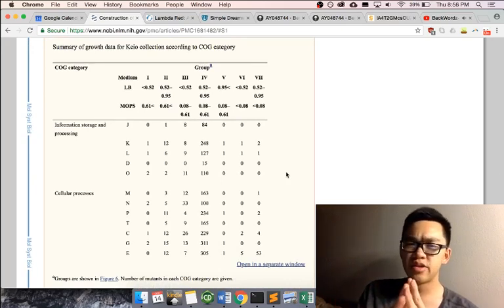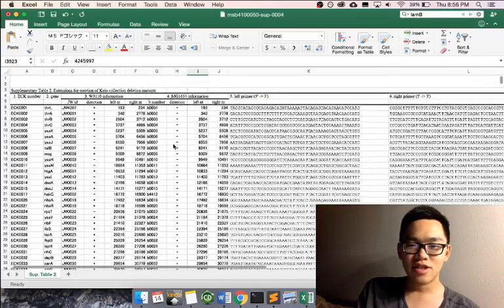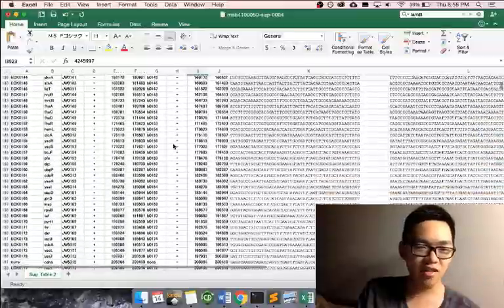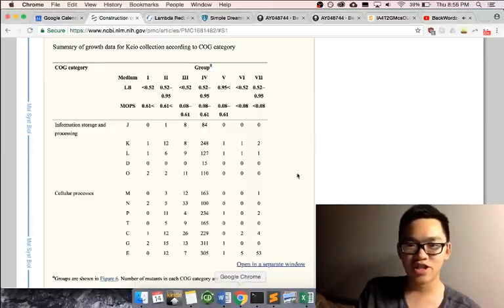I hope that kind of helps you. Just remember, PKD13 is the kanamycin cassette, in case you ever forget. That's where I had problems with. And in case you're ever looking for the primers that they use, you can look in their supplementary material, and they have tons and tons of information that you can parse through for looking at different genes.